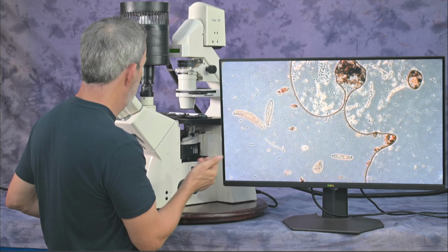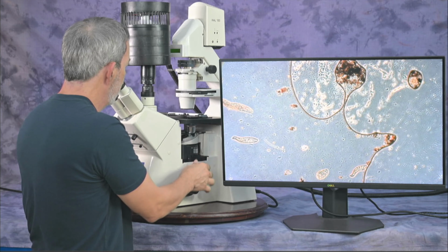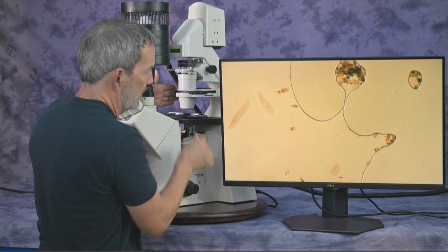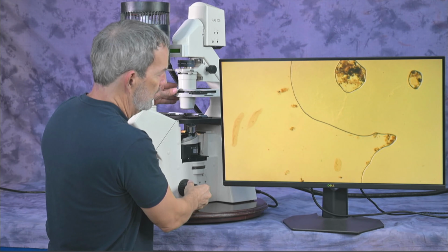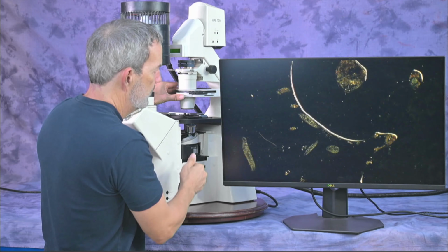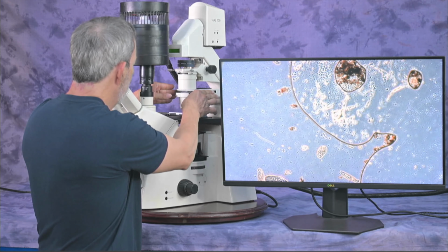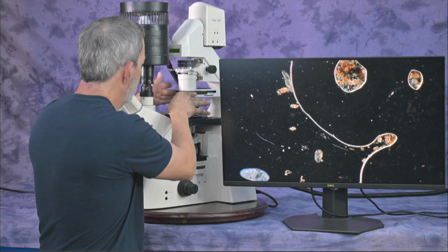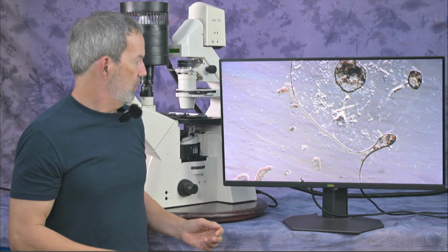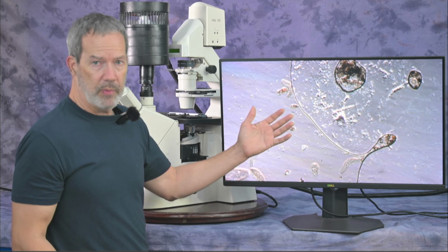So we have an image of phase contrast, and it's on the 10 power objective. One thing I want to do, I want to turn right over to bright field. So this is bright field. There's no contrasting. As you can see, it's very hard to see. When we turn over to phase, you bring out the contrasting. Now, let's do another thing. Let's go over to a Varel contrast. Now, the first thing many of you already noticed, this already has like a three-dimensional relief pattern to it.